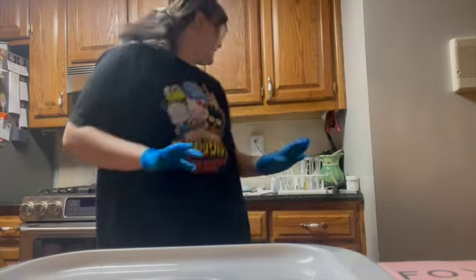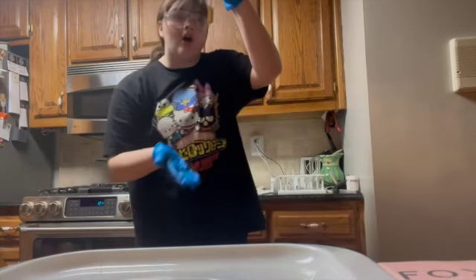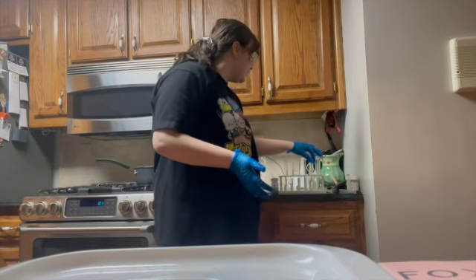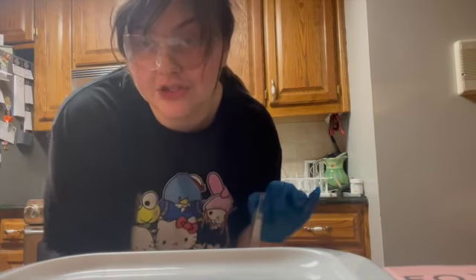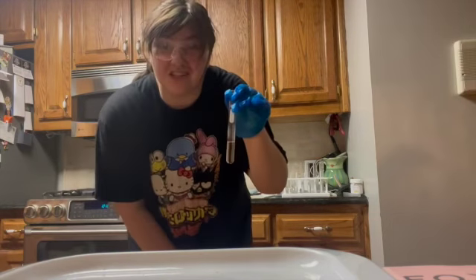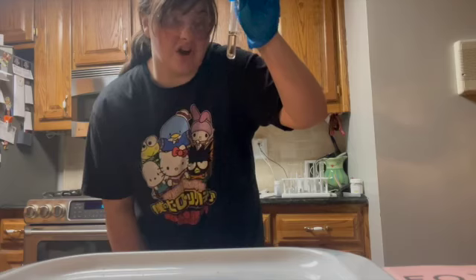30 seconds in to our part B for reaction C, and it is already at this very light orange color. This has gone a lot quicker than any of my previous ones. Yeah, and we'll see what happens a little bit. A minute 30 seconds, close to 2 minutes in, it's already very close. It's this now yellow, almost clear color. We're gonna wait just a little bit longer until it gets completely clear, but this has gone super fast.